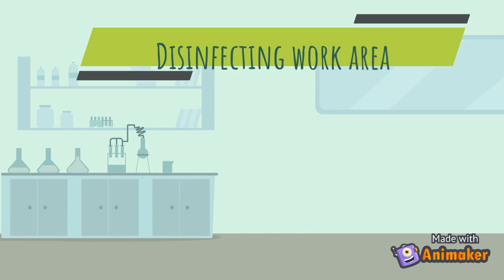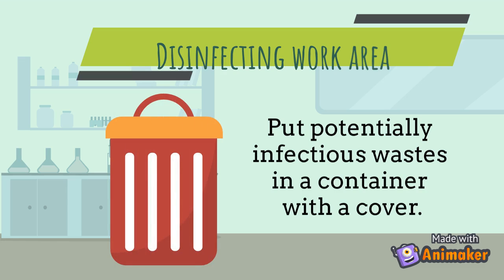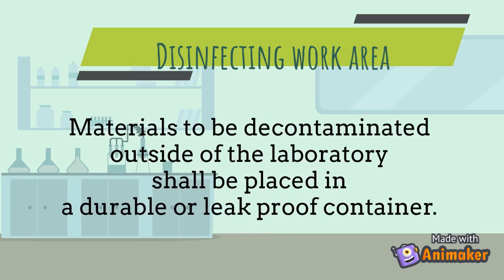Potentially infectious waste must be put in a container with a cover that prevents leakage during collection, handling, processing, storage, transport or shipping. Materials to be decontaminated outside of the laboratory shall be placed in a durable, leak-proof container which will be closed for transport.